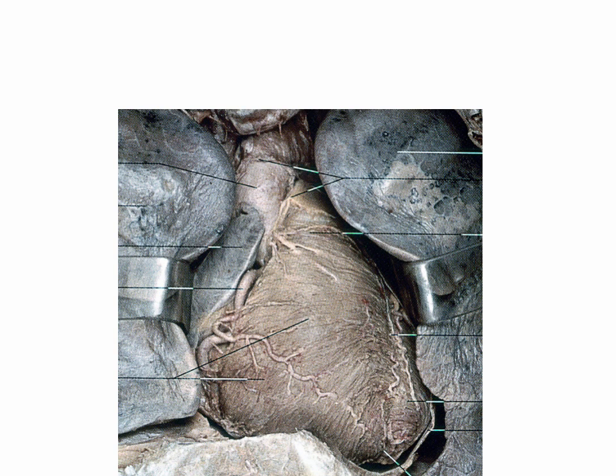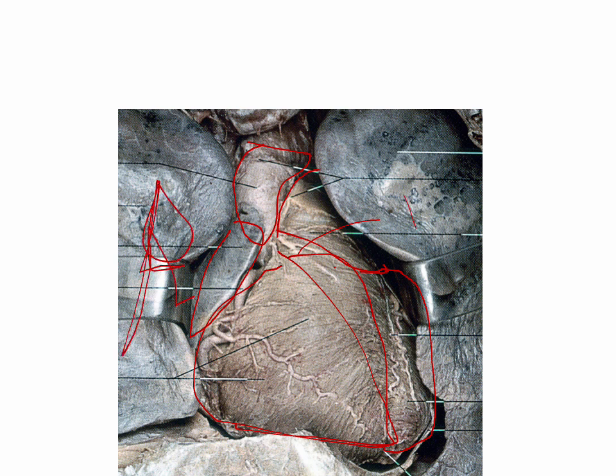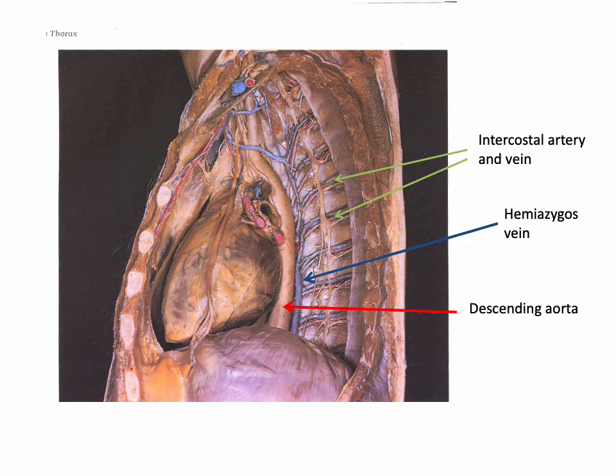Same again here, same structures. This beefy area here is part of the atrium, right ventricle, and you can see here, this will be the division. So this area here will be the right ventricle, and a little bit hidden behind it is the left ventricle, okay? And here you can see a little bit of the right atrium, pulmonary trunk, and again right lung, left lung.